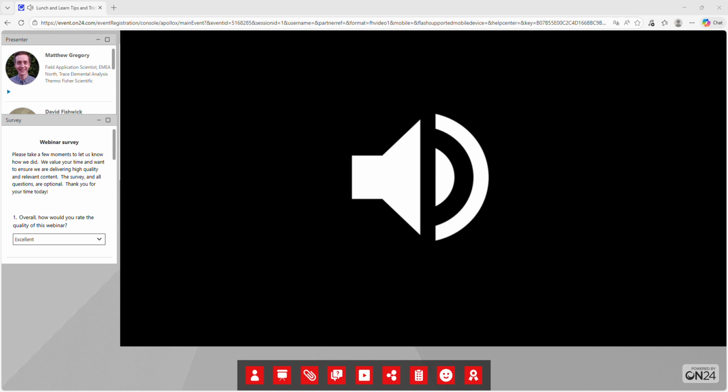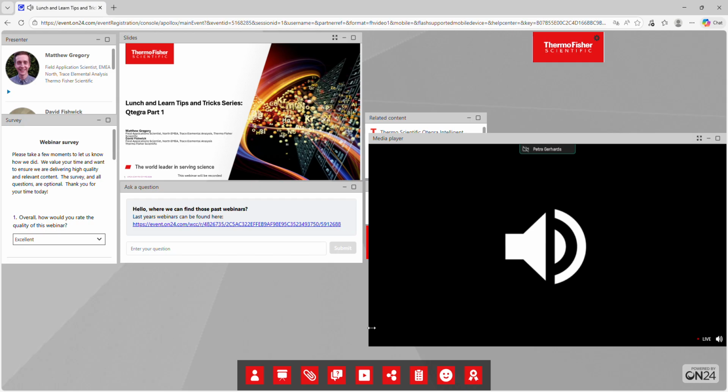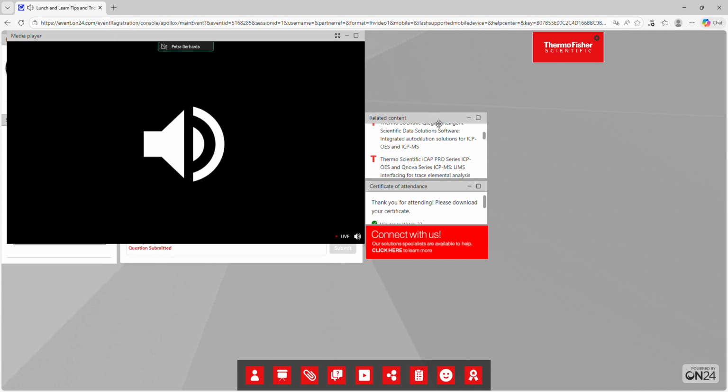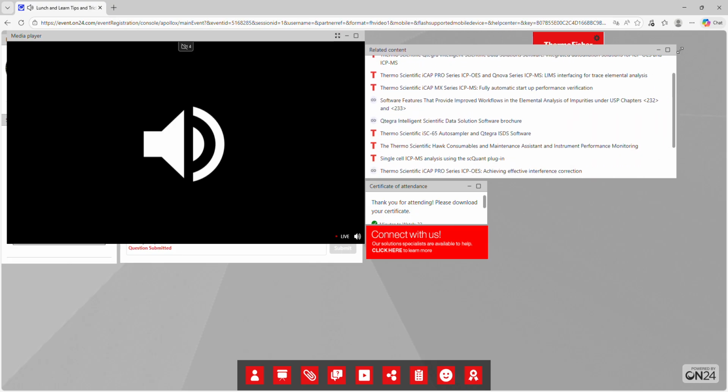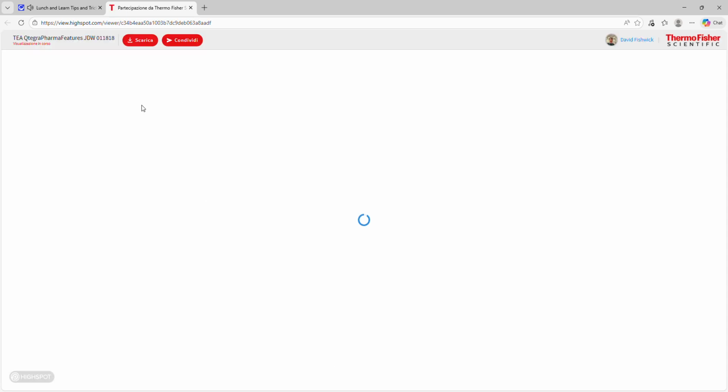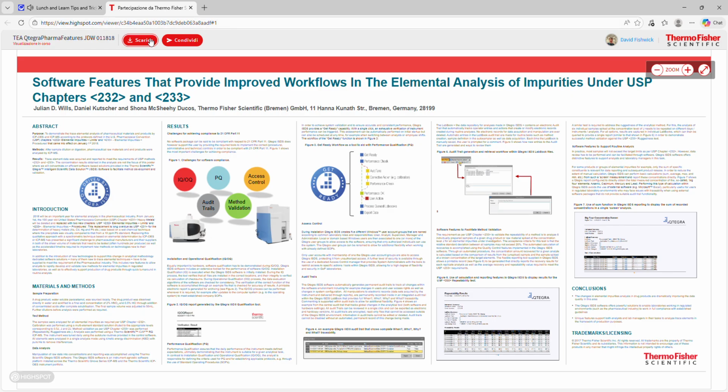Thank you very much. I guess that answered the other question as well. So I have an ICAP OES. I can sort the analytes of interest alphabetically, and it saves that order with the corresponding icon. But when I'm reprocessing data, that order disappears whenever I make a change to the sample list, for example, to remove a calibration standard. The alphabetical order disappears for both concentrations and intensities. I've already tried different method configurations, but none of them work. Do you have an answer for that one?